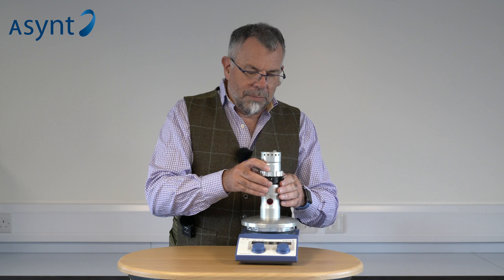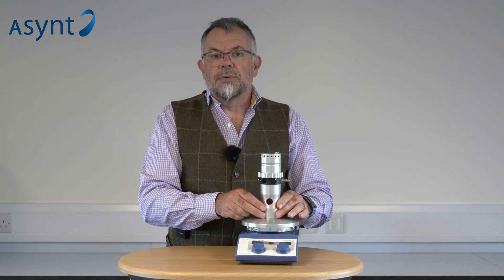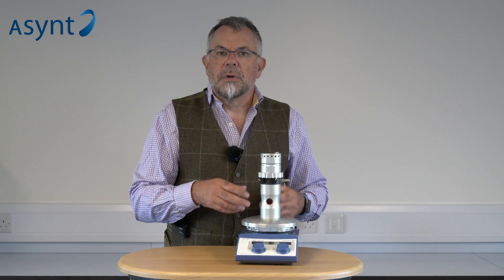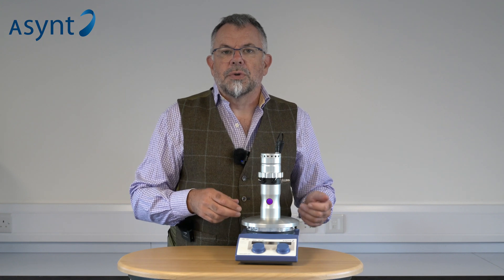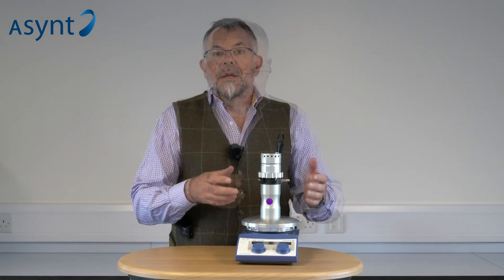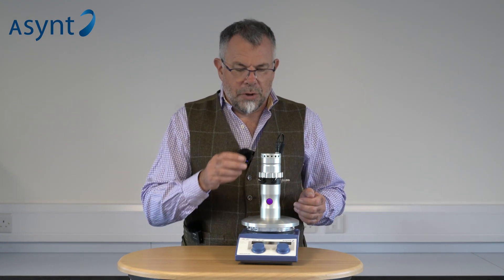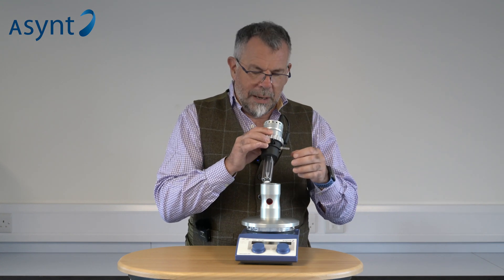It simply drops into this holder on top of a magnetic hot plate stirrer. This shields the user from any harmful light and has a micro switch to stop operation if you try and remove it. To turn the unit on, you simply plug in to our 24-volt, 90-watt power supply. You can probably hear the fan starting — keeping the electronics cool is critical to the longevity of the LEDs. Here we have a small filter window to allow you to see it's in operation. If we try and remove it whilst it's in operation, the light turns off immediately, but the fan keeps running, keeping the electronics cool.